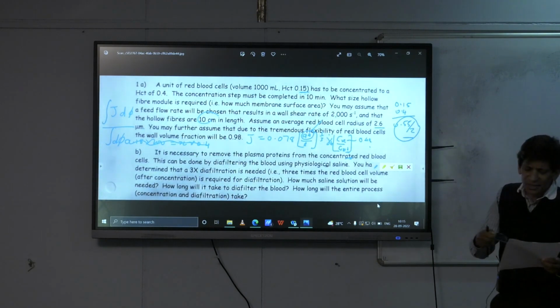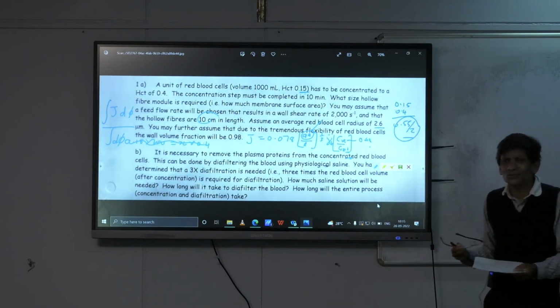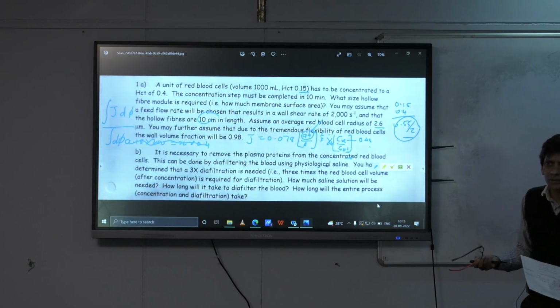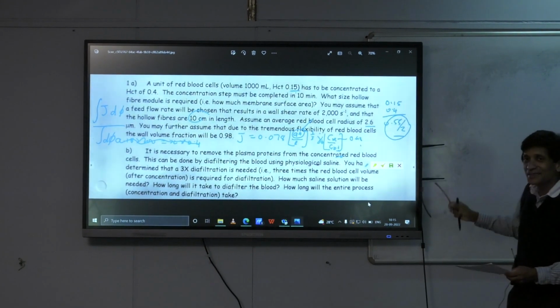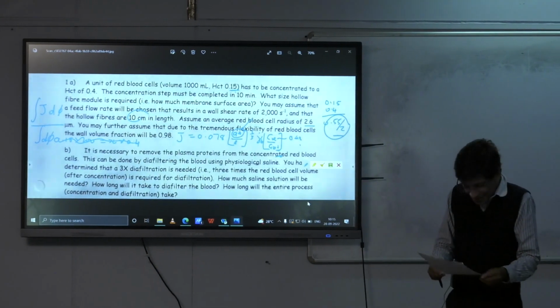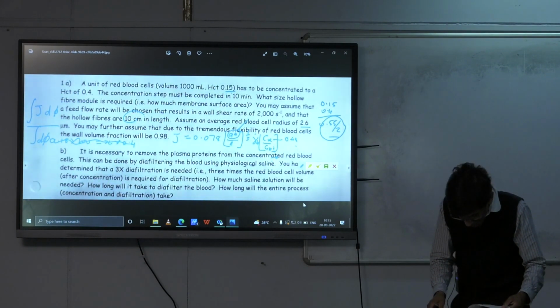And also remembering that if you do the actual mathematical calculation, the reality is you might have a few lysed, broken red blood cells, you might have a few other things, which will mean that your flux may be lower than you predict, okay? So all of those answers are fine. Okay, did anyone get an answer? Did you get an answer using this value? Okay, all right. So I'll let you keep working on that, and then you can tell us what you get for the membrane surface area. Is that okay?